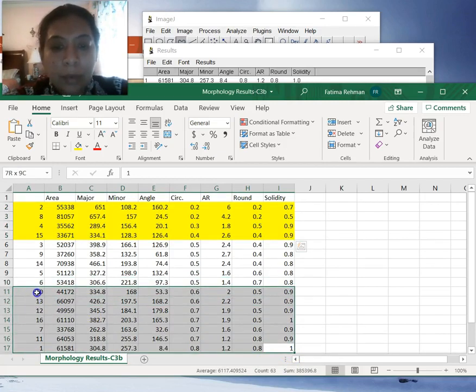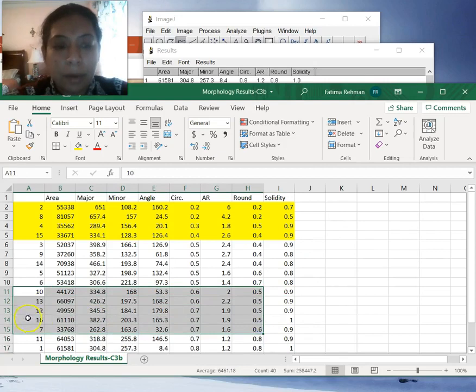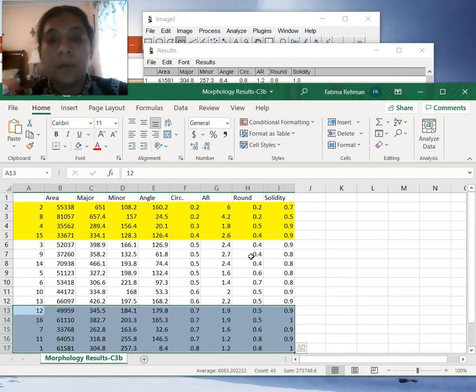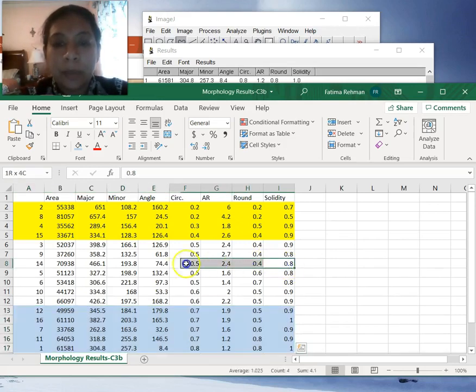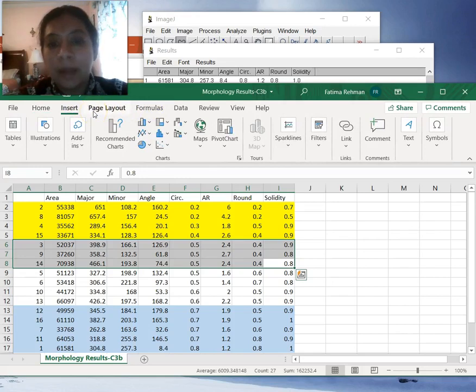So typically, we would take any number with a circularity factor of, let's say, 0.7 and above to be fully undifferentiated, and you can color code them in different ways, and numbers that are 0.4 and below to be differentiating. For the rest of them, it would depend then, so they had the circularity and then the roundness. You can now look at the roundness factor and see if that helps you figure out some of those as well. So any of these where the roundness is still below 0.5, we can go ahead and place them into our elongated or beginning to elongate form.